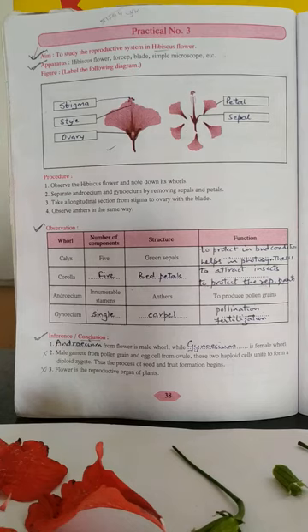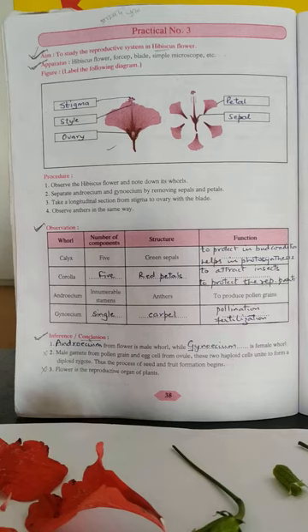Good morning, students. This is your practical period, and today we are going to have practical number 3, experiment number 3, and the aim for the same is to study the reproductive system in hibiscus flower. Apparatus: we should have one hibiscus flower. We need a forceps, blade, simple microscope.